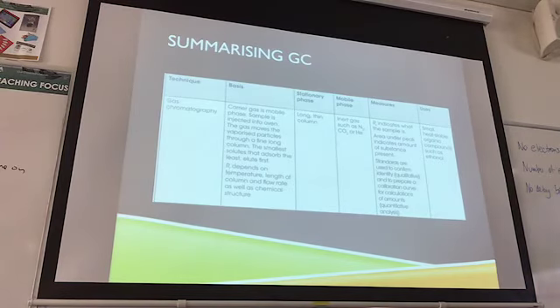So it's useful for small heat-stable organic compounds, things like ethanol or for alcohols. It's no good for things that are not heat-stable. So if it's something that if you heat it up, the structure breaks down, then it's not going to be very useful for those kinds of things.